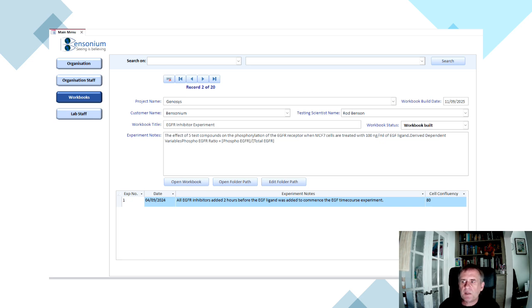And this is something that is becoming more and more necessary for modern publications, as many journals now require a much better audit trail from their scientists in terms of how they got to the visualizations and the raw data that lies behind those visualizations. So the Platemaker Wizard sorts all this out for you.